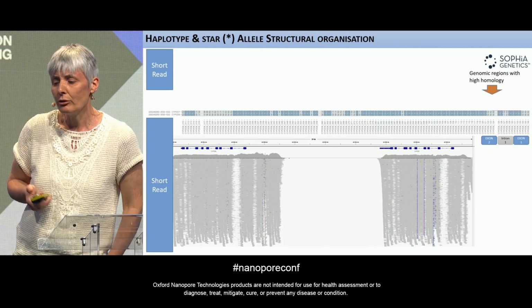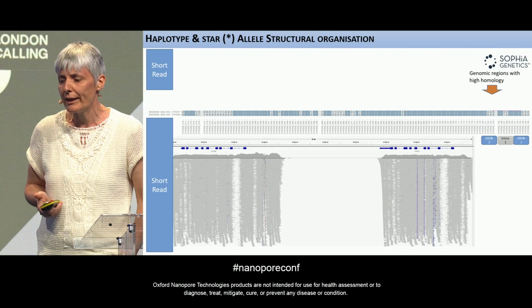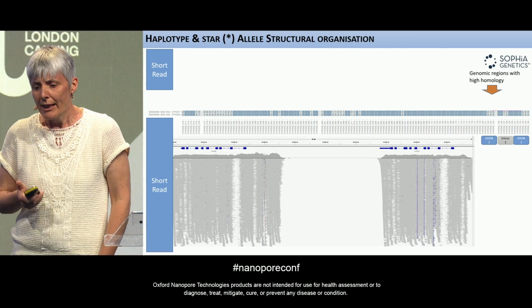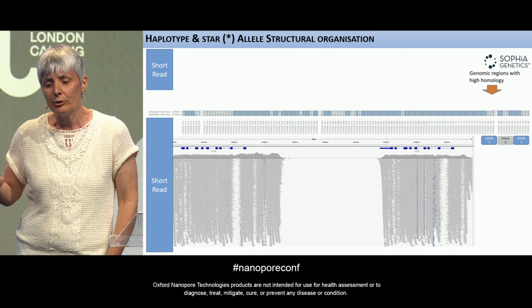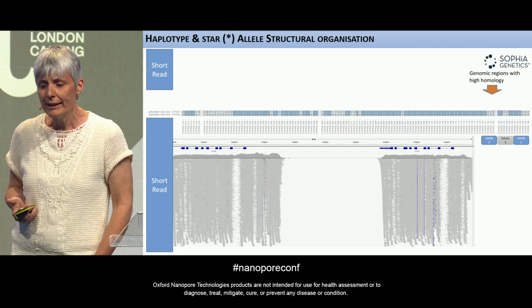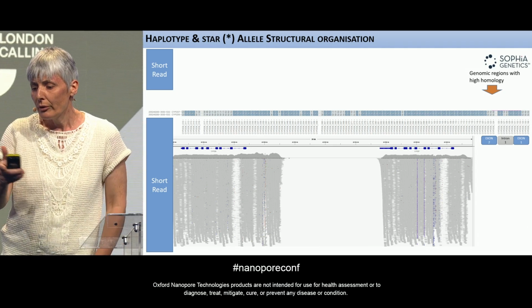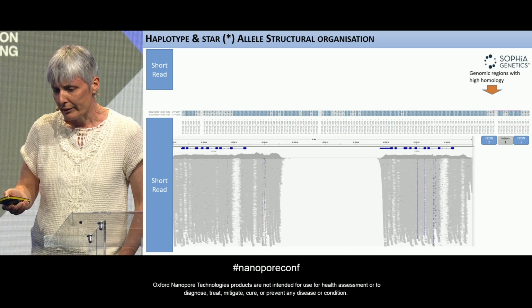So now, currently in my hospital, we developed a very nice, accurate tool with the company Sophia Genetics. It enables us to study CYP2D6 and CYP2D7. As you can see, we are able to count the copies of both genes. Normally, we have 2 alleles.